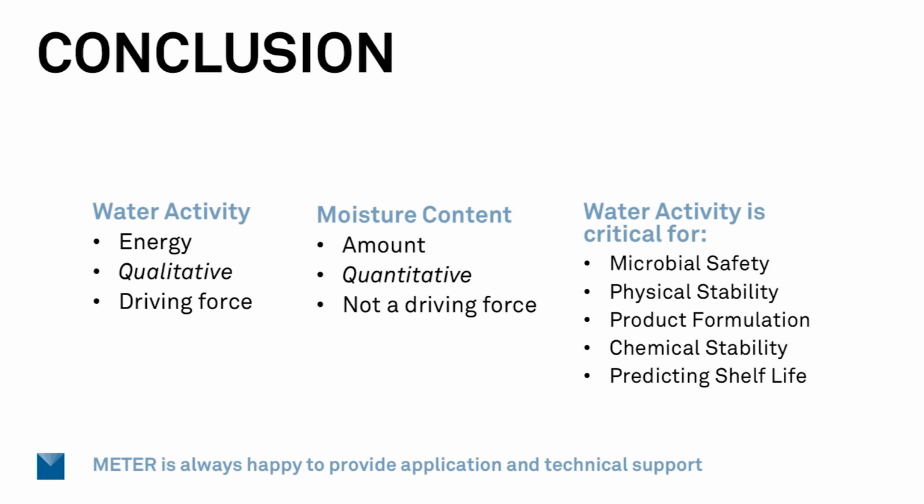For moisture content, it really is just the amount of water. It doesn't tell you what the water is going to do. It just tells you how much is in there. And it is not a driving force. So we're just talking about a quantitative amount, and that's all it's going to tell you.